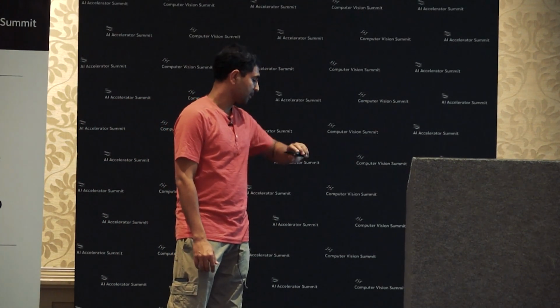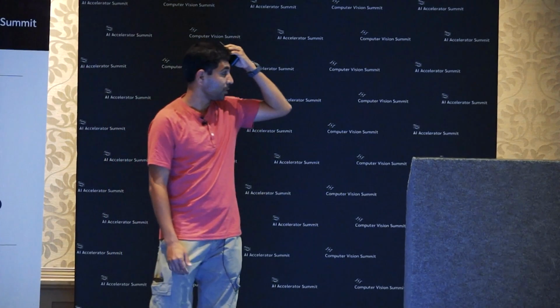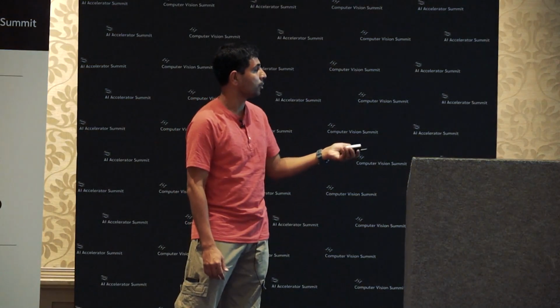So I'm going to use this as a segue to jump into microscopy a little bit, something that I do quite a bit at Calico. So what we saw here is an example of fluorescence. You actually see a dye that is fluorescing at a particular color when a light of a certain wavelength is shown on it, right? So this has been used in microscopy for decades.